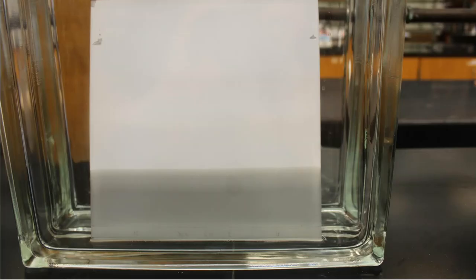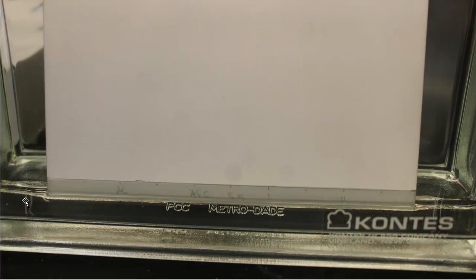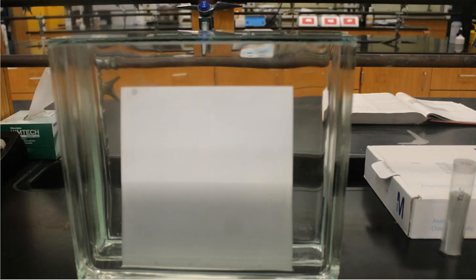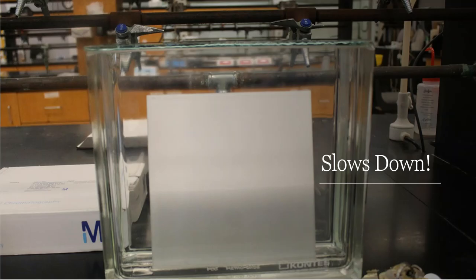So 3 minutes later, it goes from basically this level to this level. And again, you might look at this and think, this is moving pretty fast. All right, this is not going to take an hour and a half. What's he talking about? Well, at 1:44, I then go back and take more pictures for you. So now we are about 15 minutes after the very first dunk. And what it looks like now, here's my first one, here's my second, and here's my third.